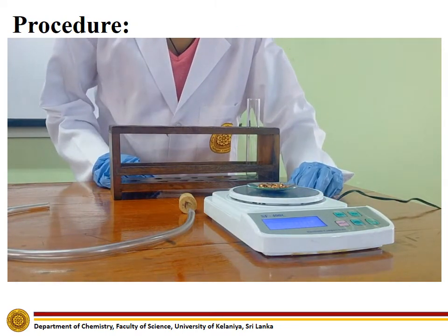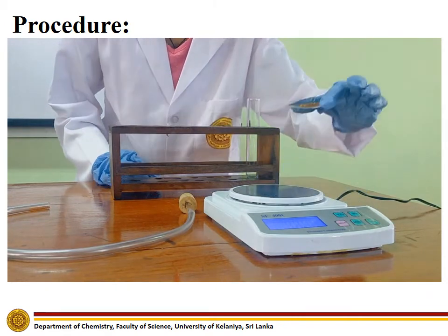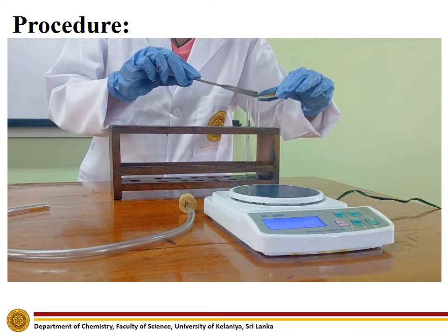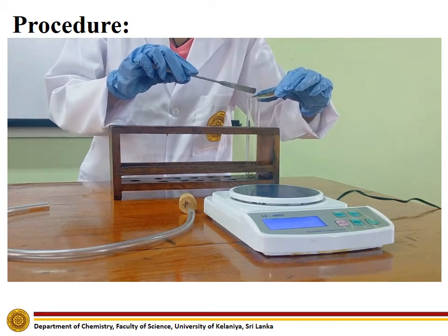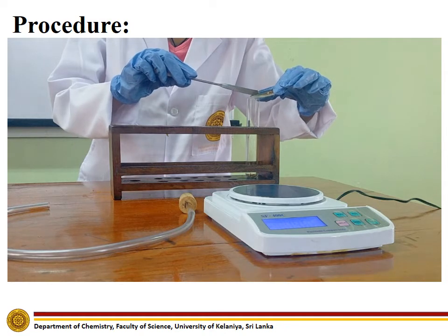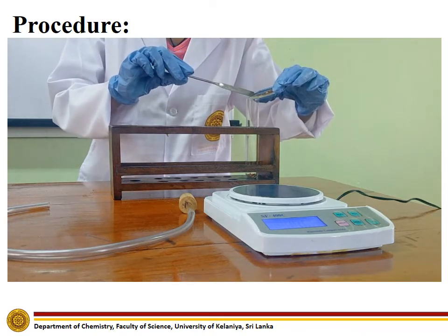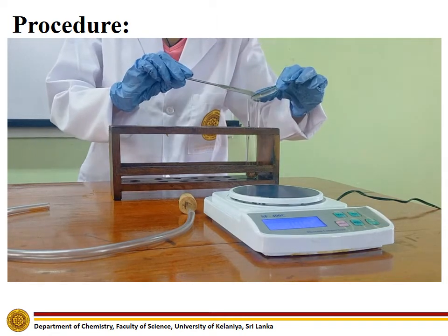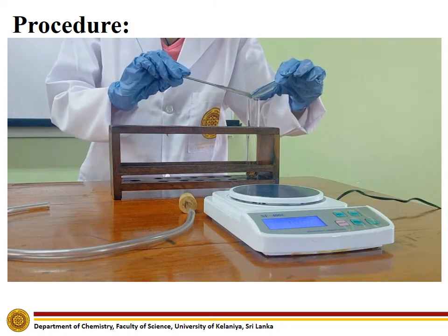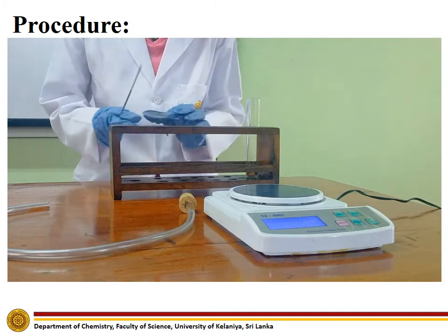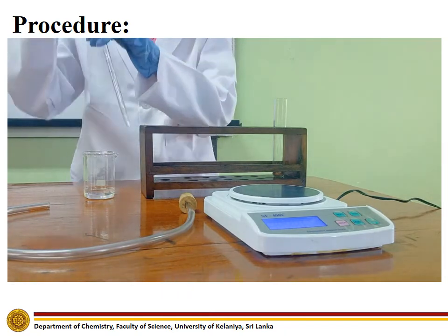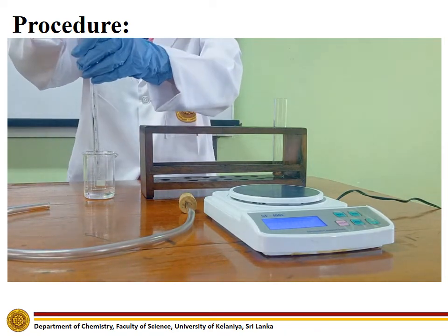First, measure about 5 grams of copper turnings using the electronic scale and put them into a boiling tube. Using a well-washed pipette, measure about 5 ml of concentrated nitric acid and add it to the boiling tube containing copper turnings.